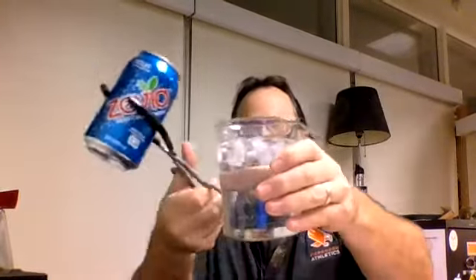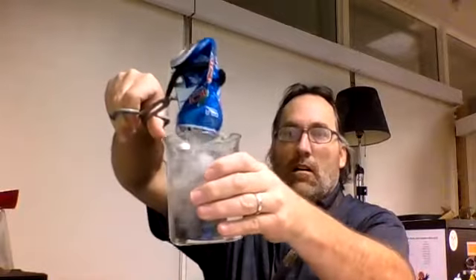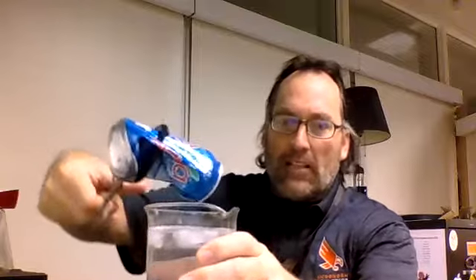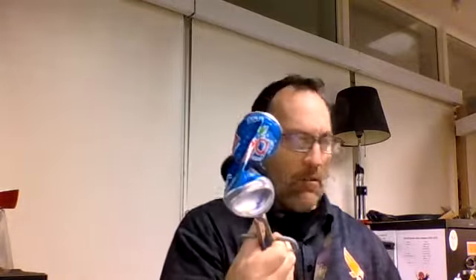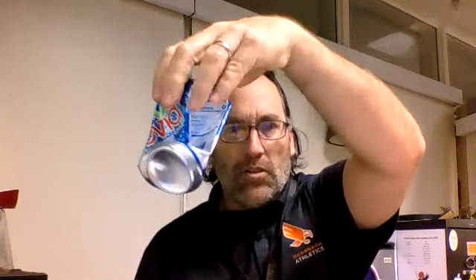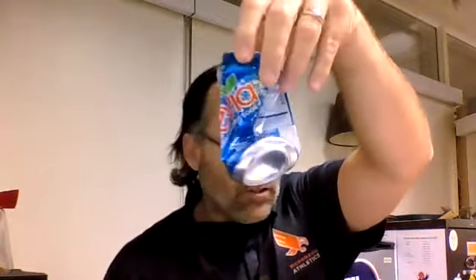Okay. Here's our can. Here's our ice bath. All right, so hopefully you can see that. That is an implosion. Again, what I want you to do in your lab manual is go ahead and write down, was this a chemical change or a physical change? And then what's your justification? Why is this chemical, or why do you think that this implosion to our can was a physical change? So chemical change, or was it a physical change?